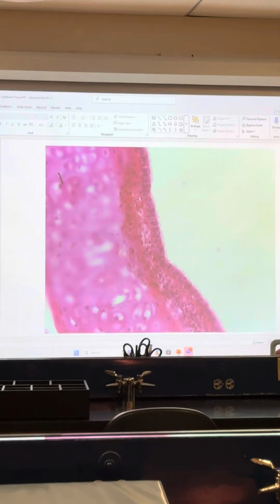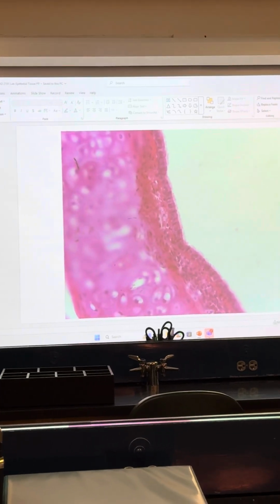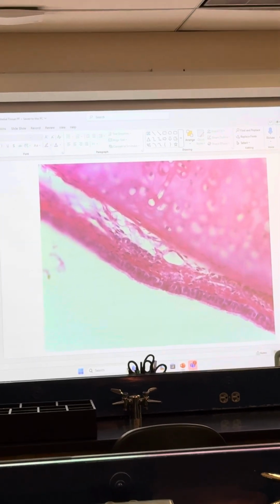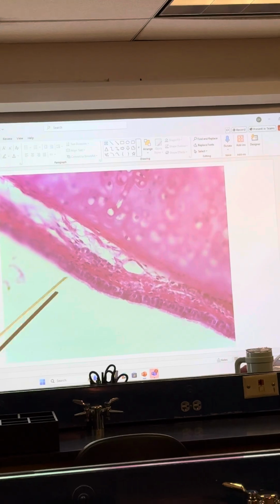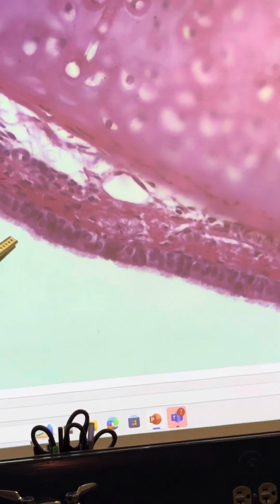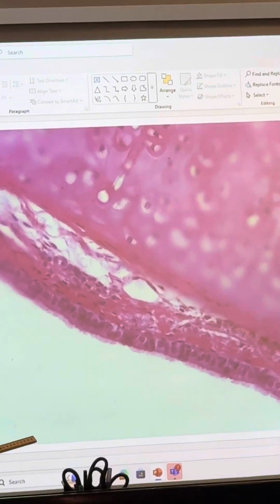So let's go here. We're gonna look at the lining on the very right side of the color there. So let's go here and then here. What kind of epithelial tissue, I'm giving away there. What are we looking at here? This guy is pseudo-stratified. It looks like it could be stratified, but it's not. They all connect onto the basement membrane. Pseudo-stratified, what is this? Ciliated. Pseudo-stratified, ciliated. What's the shape of the cell? Columnar epithelial tissue. That's one of the longer ones.